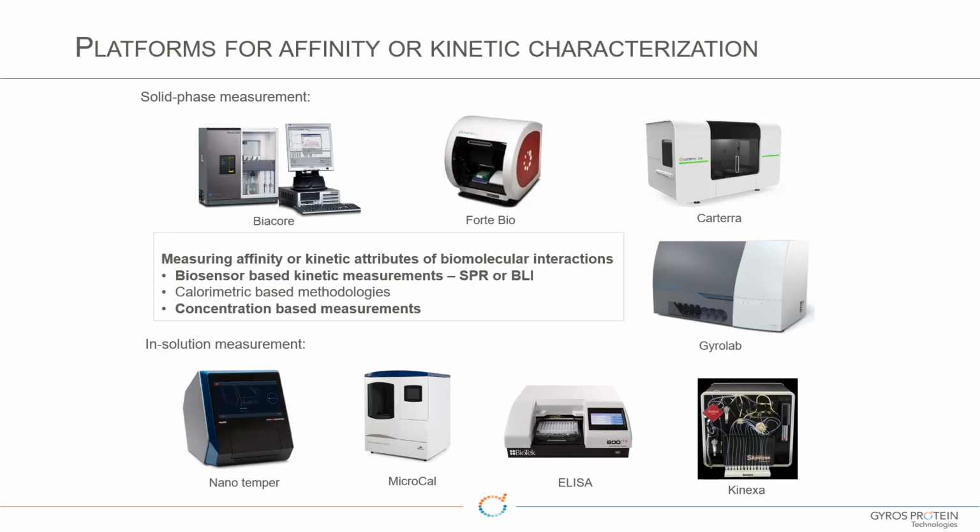Well, when looking at the affinity landscape, there's certainly no shortage of options for someone to dive into, make measurements of affinity. And of course, probably the gold standard for everybody is Biacore with the solid phase measurement, and then there's others, the ForteBio and Carterra, which also use solid phase technique.